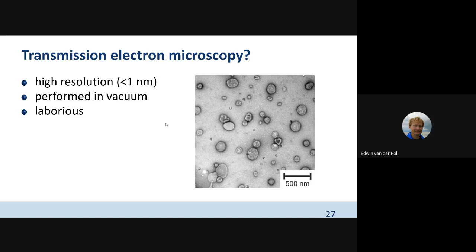It's very nice for research because you get an image. And you can even quantify features from this image. People interested in machine learning developed even programs which could automatically recognize vesicles from such images. But I think for clinical diagnostics, it's a long shot. There is no society who can afford it at the moment to do on a large scale laborious transmission electron microscopy imaging for diagnostics.